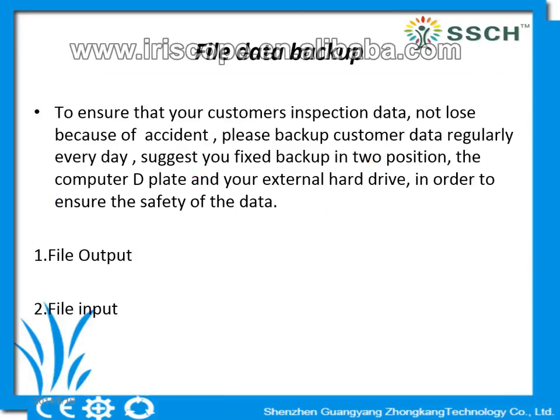Now, let's talk about the file data backup. To ensure that your customers' inspection data is not lost because of accident, please back up customers' data regularly every day. We suggest you keep the backup in two places, the computer hard drive and your external hard drive, in order to ensure the safety of the data.